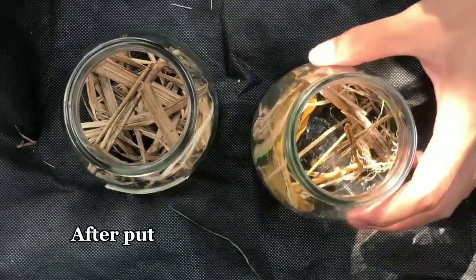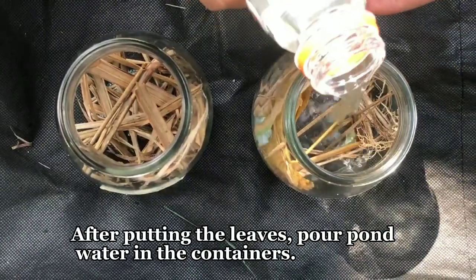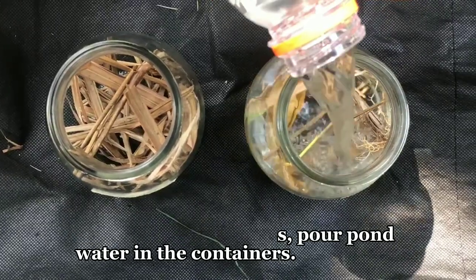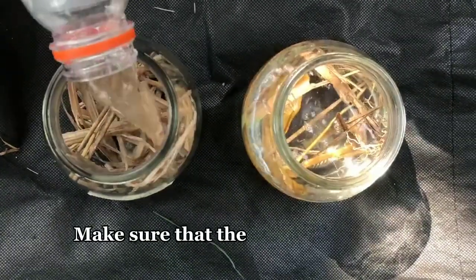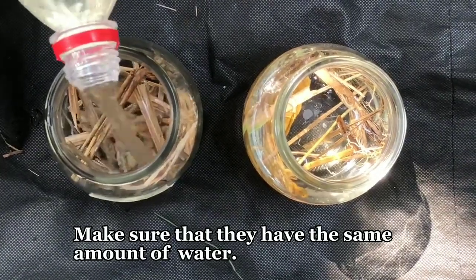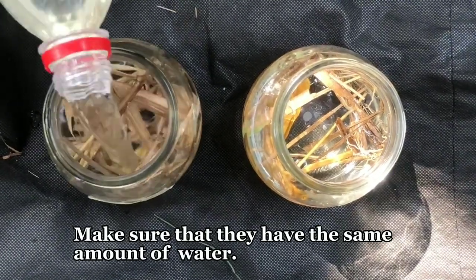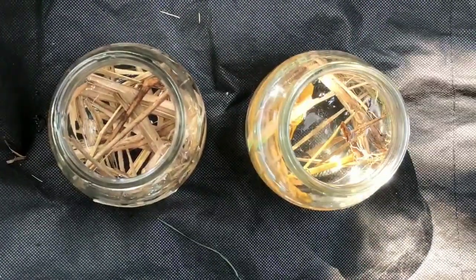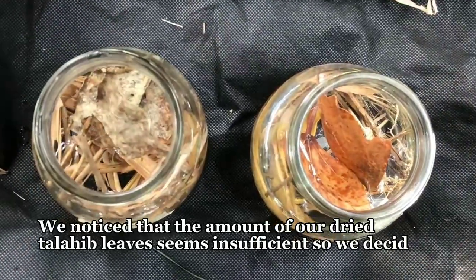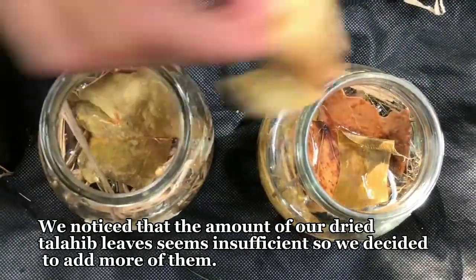After putting in the leaves, pour pond water in the containers. Make sure that they have the same amount of water. We noticed that our dried talahib leaves are insufficient, so we decided to add more dried leaves.